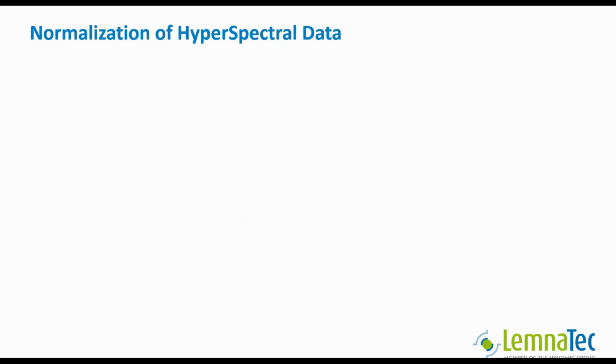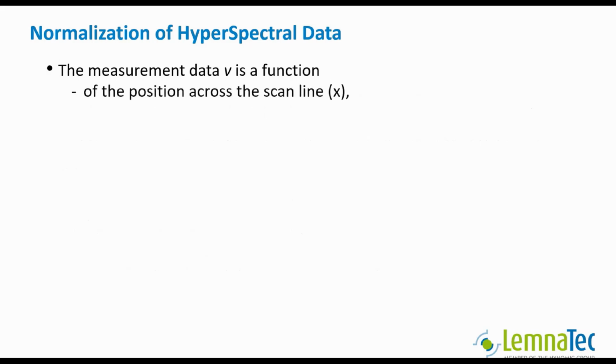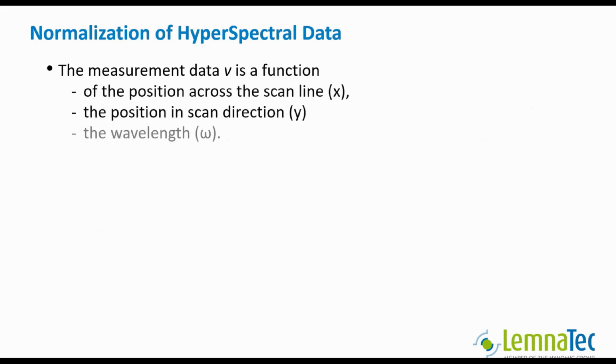In contrast to the additional data cubes, the actual data cube depends on all 3 dimensions: X across the sensor line, Y in scan direction, and the wavelength omega.